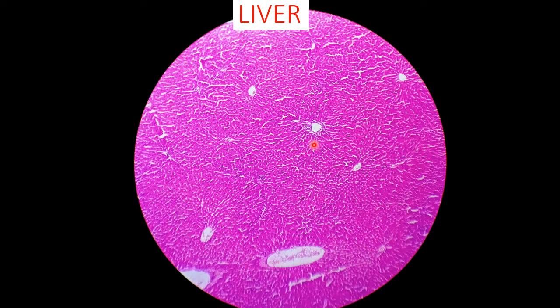So what are the identification points to write? Hepatic lobules can be seen, the central vein is present, and the portal area. At every corner we can identify a portal triad consisting of a hepatic arteriole, bile ductule, and portal venule. Here you can see one portal triad, here another, and here another. These three structures you can see clearly if you focus under 45x or 100x.